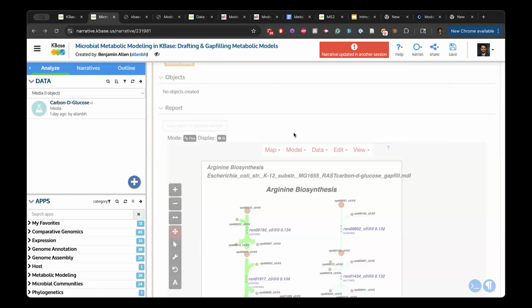In order to complete a step, it might add one reaction, while your organism in reality probably has an alternative pathway that is 3 or 4 steps. The algorithm tries to add the least amount of reactions possible. With CarveMe, usually you are able to get models with less gap filling, because they're going over a universal model built out of these big manually curated models.